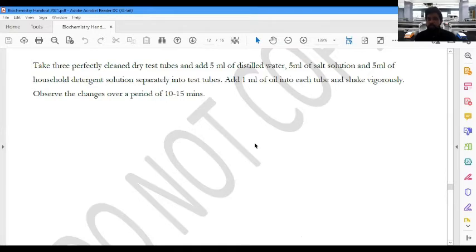We have a great concern about cholesterol, because it can cause lots of adverse health conditions in humans. It is a kind of lipid, but the properties of cholesterol are somewhat different from true fats and lipids. The Lieberman-Burchard test and the Salkowski test.